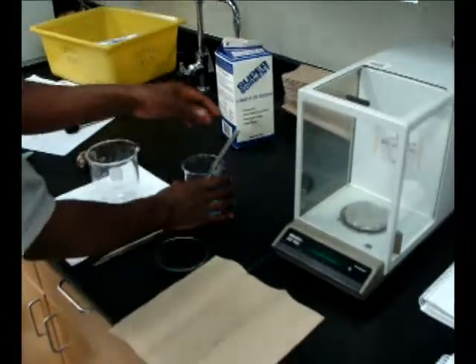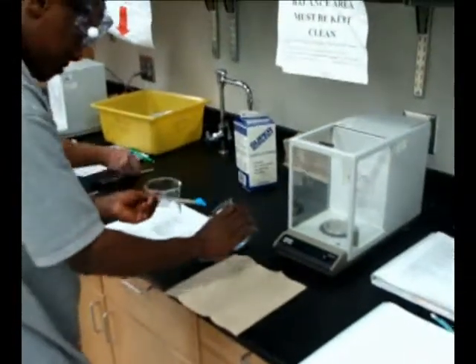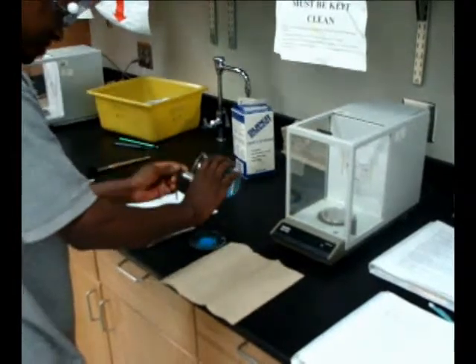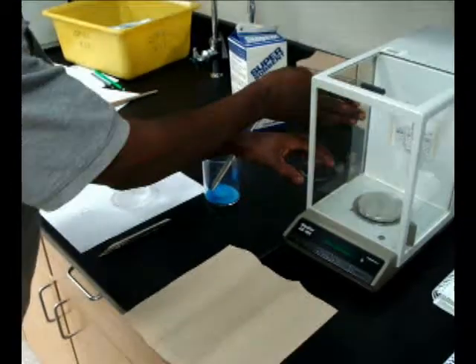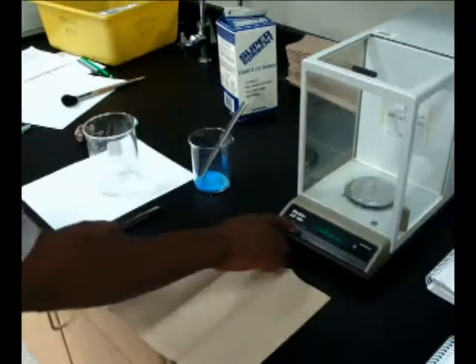Always place the specimen in or on a separate vessel away from the balance, rather than placing the sample directly on the pan. This will ensure that the pan stays clean and that your following measurements are as accurate as possible. First, measure the mass of the vessel to be used and record this initial mass value in your notebook.